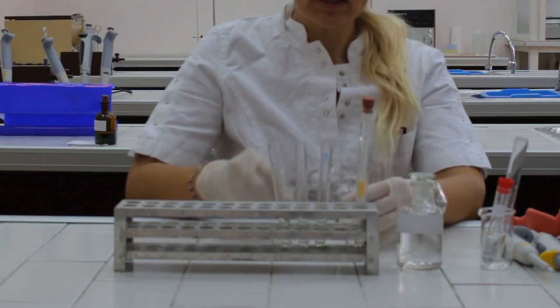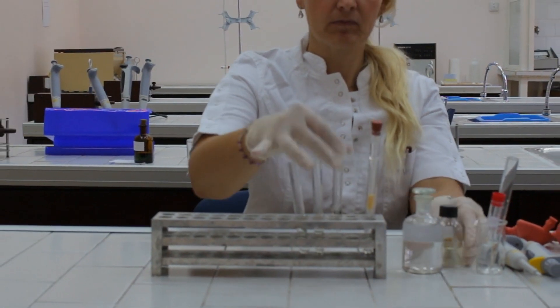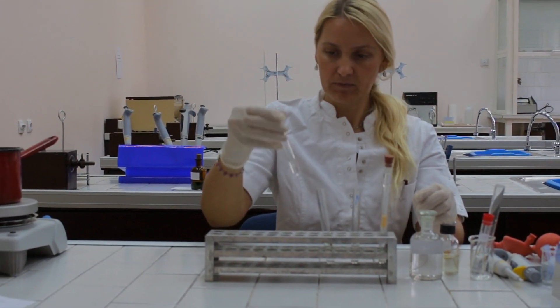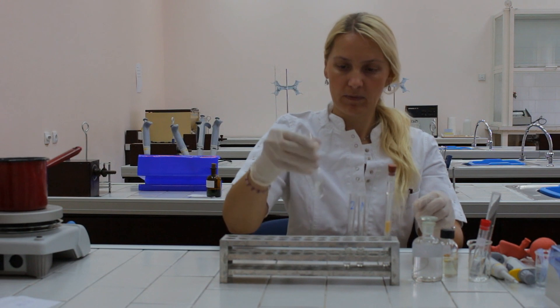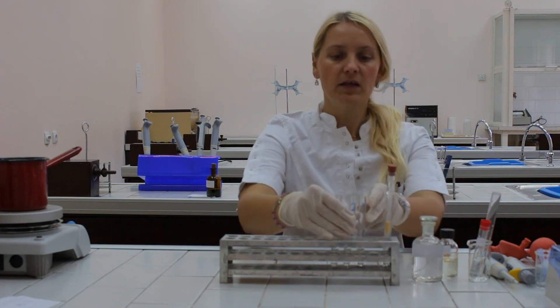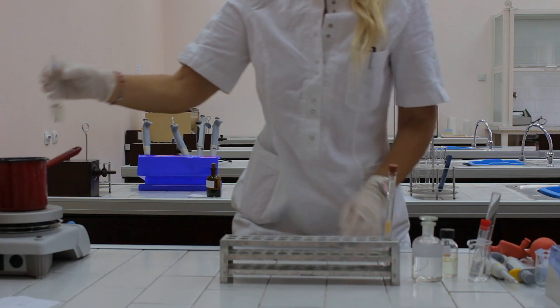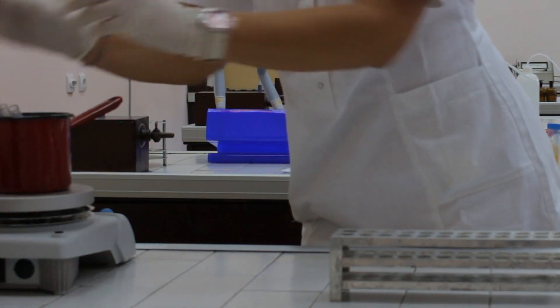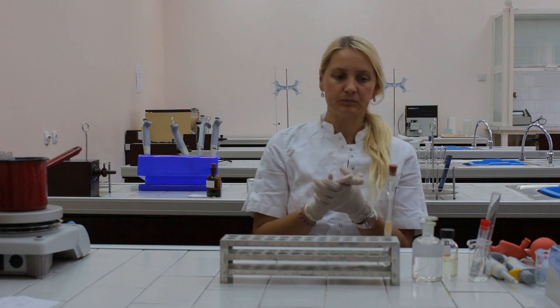After mixing the test tubes, they should be placed in hot water for a few minutes. Wait for the blue color to develop, which is a result of the reaction of amino acids present in the solution with ninhydrin reagent.